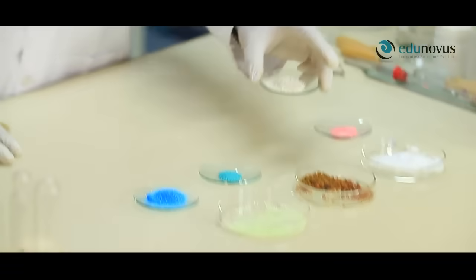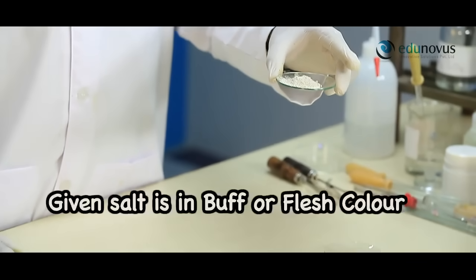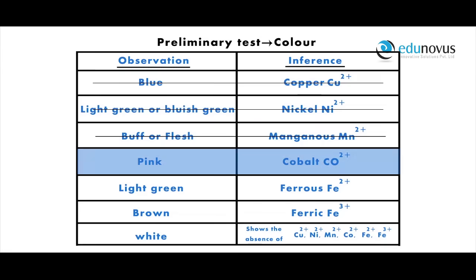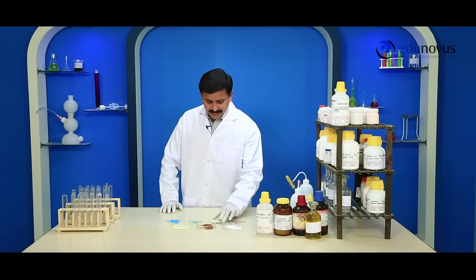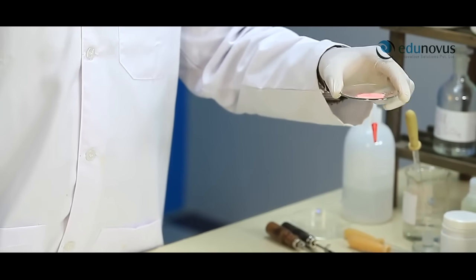If the given salt is in buff color or flesh colored, it may be a manganese salt. If the given salt is in pink color, it may be a cobalt salt.